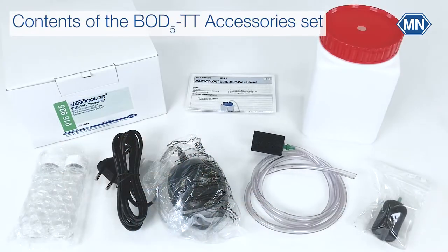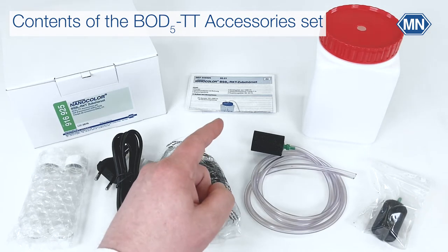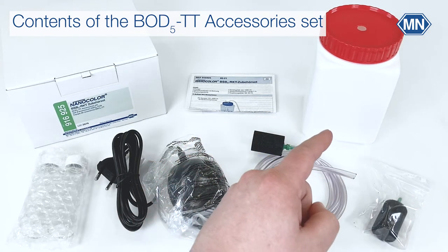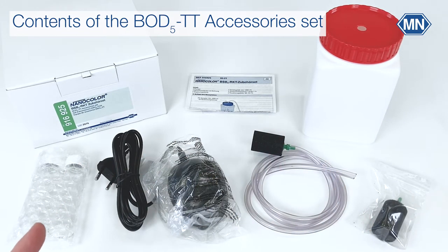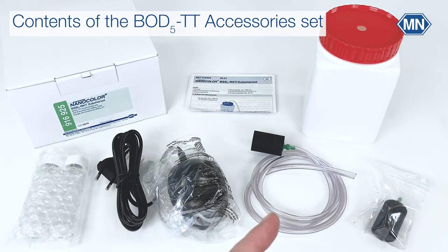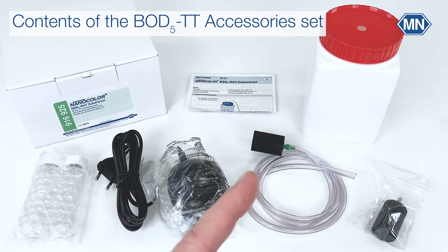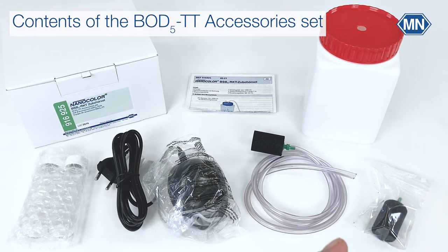The contents of the BOD5 TT accessory set are instructions, a storage vessel with a red lid, two reaction vessels, an electric air pump, a flexible tube with an aerating brick attached to it and an extra aerating brick.